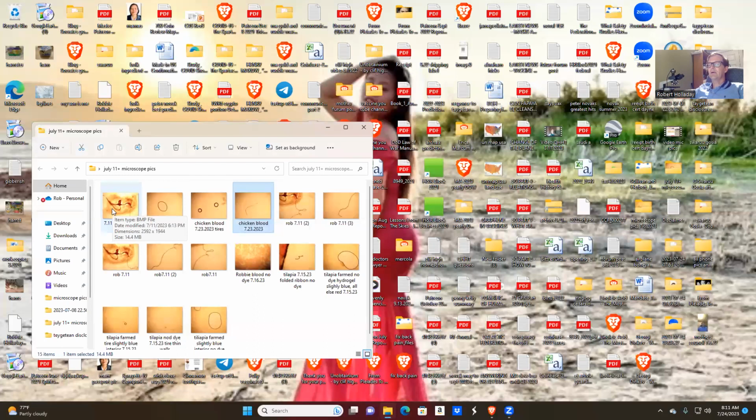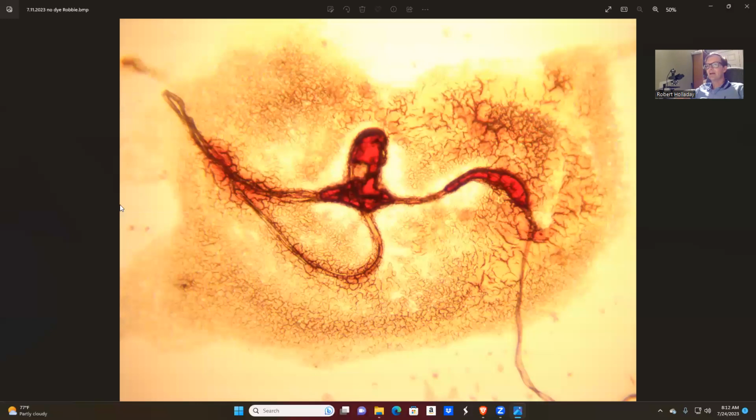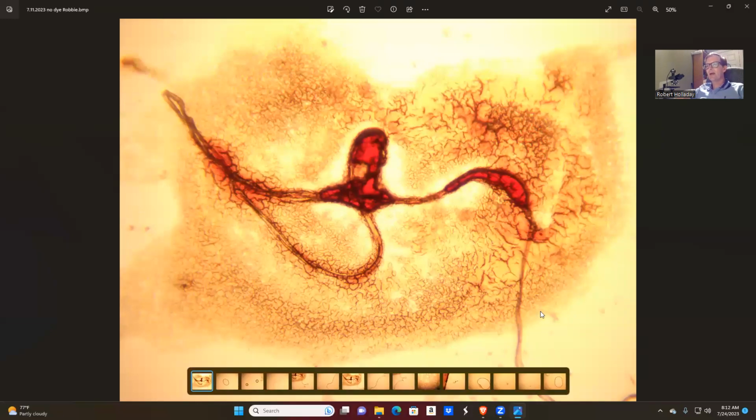It's hard to tell what's the most contaminated because all the meat I've looked at has been contaminated. The chicken and beef samples I looked at were fairly watered down. They were mixed in with a lot of other body fluids, it looks like. It was just diluted, but in the tilapia, the blood was really thick and there was a lot more Microtech in the tilapia. But because the blood samples I took were so different, I really can't tell what had the most. Although with the chicken, I can definitely say that the free-range chicken seemed to have more Microtech than the store-bought chicken. Really surprising. But this is a huge folded ribbon I found in my own blood.